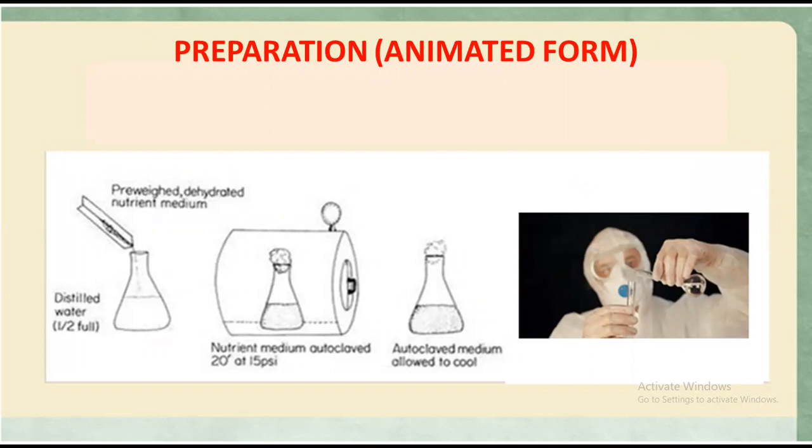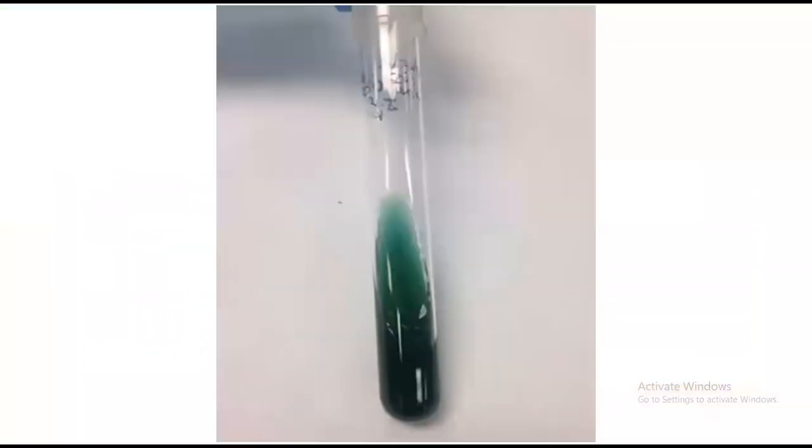You should also sterilize the test tubes, because we have to pour the media into the test tubes. Just look here at this technician, this microbiologist. He is pouring the media into the test tubes. After that, you have to incubate it.